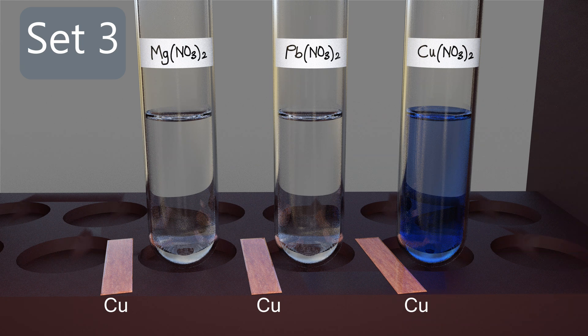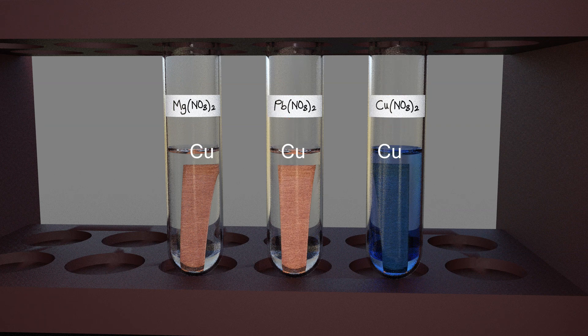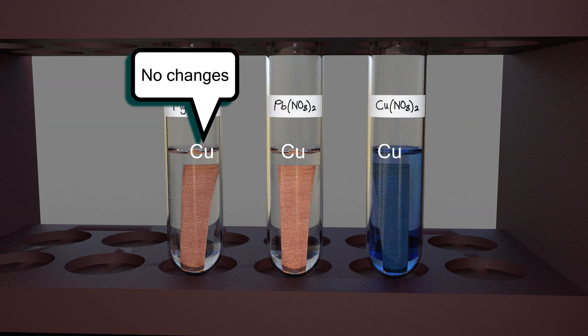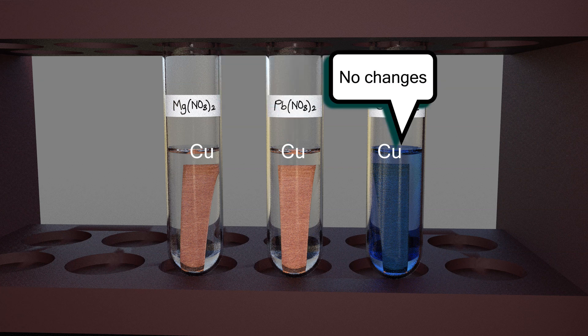Prepare three strips of copper. Add a copper strip into each of the three test tubes of set three and observe for any changes. No changes can be seen in all three test tubes of set three.